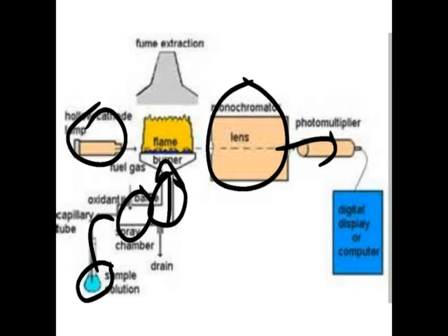So that is the instrumentation behind the atomic absorption spectroscopy.